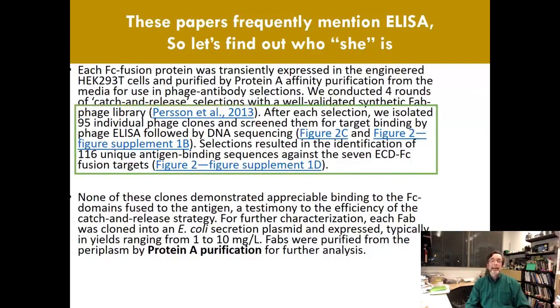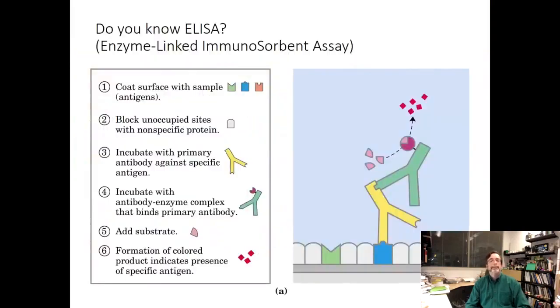It's a way of using antibody to determine binding. And it's really nice because you can do it in a 96 well plate. That means you can do 96 experiments at once, or more likely like 7 experiments at once, given controls in different concentrations. Okay. So this is what ELISA is like, and I want you to notice how it's like the previous thing we have, where we have 2 antibodies working together. And it's really a binding assay.